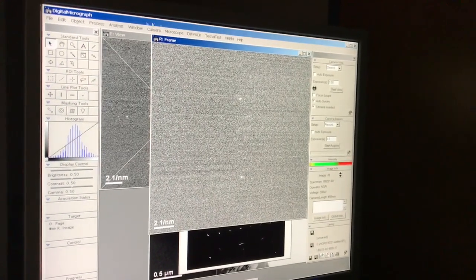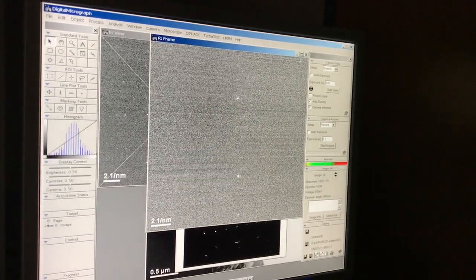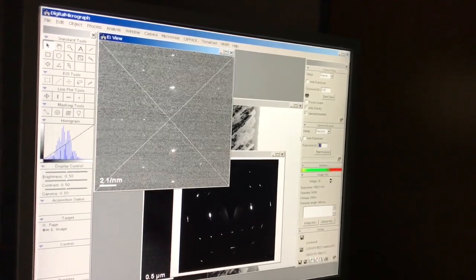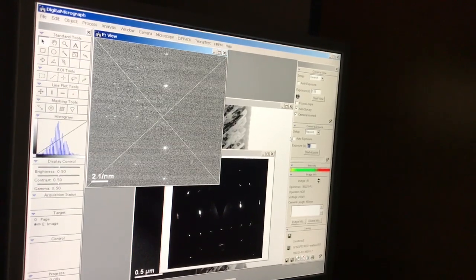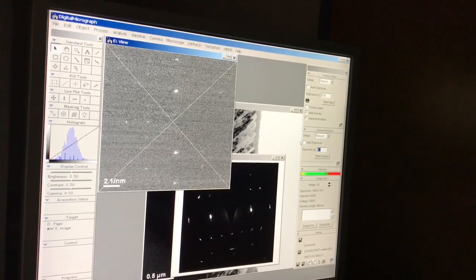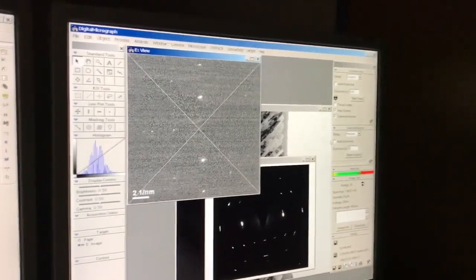Right, and I'm getting like nothing. Okay, I'm barely clipping 300 counts. So realistically now, if I multiply that by 10, I should get to 3,000. Okay, so if I go 3-4 seconds, that should be plenty. In fact, I could probably go 5 and not have an issue.